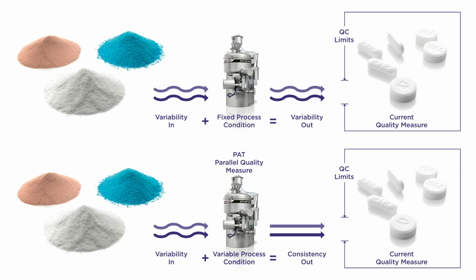As we well know, PAT means process understanding. Manufacturing companies are starting from the assumption that using raw material from validated suppliers gives a constant process. In reality, despite all the effort, it's not possible to guarantee that the final target is constant without studying how the experimental domain is impacted by quality attributes. FDA requires a very accurate and precise method to determine the granulation endpoint.